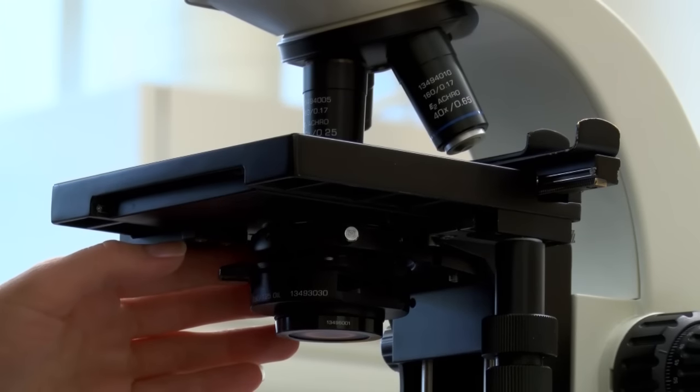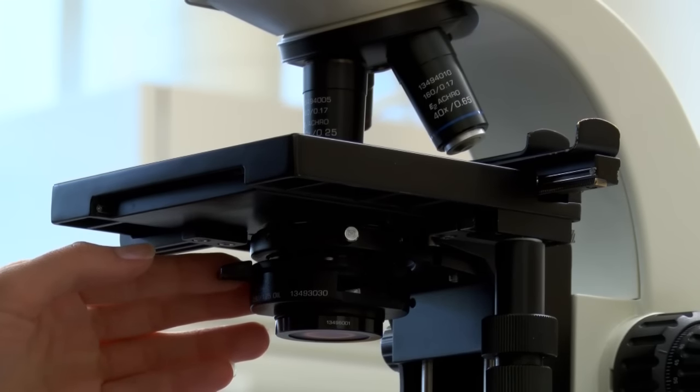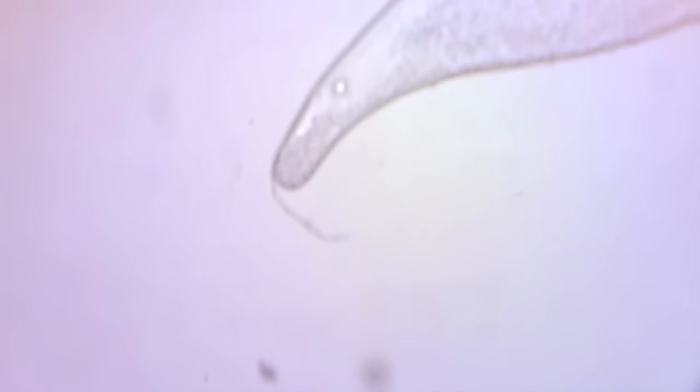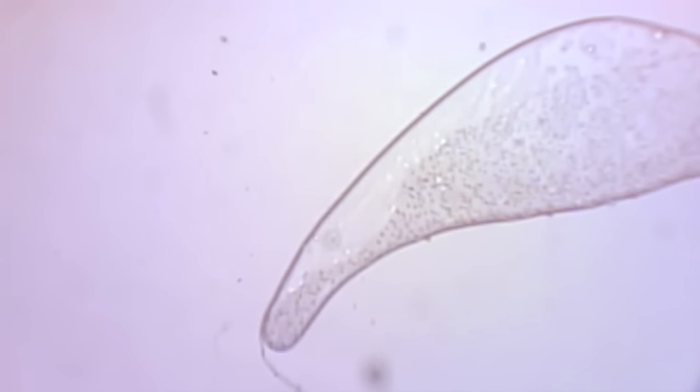If you are observing unstained specimens, use the stage diaphragm to reduce the amount of light passing through. Also, try to find a bubble or other easily observed object under the cover slip and focus on that.